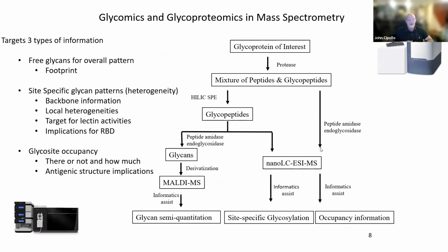Getting on a little bit to mass spectrometry. What I'm displaying here is a very simplified flow. I'm not going to go deeply into this, but just to say that there are three different prongs in mass spec approaches for glycomics and glycoproteomics analysis.